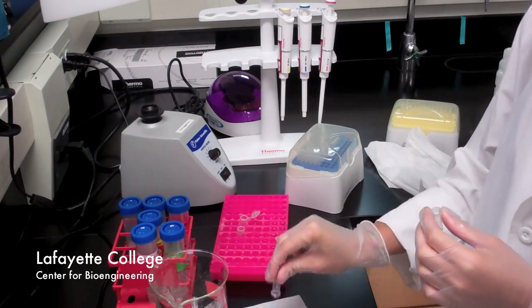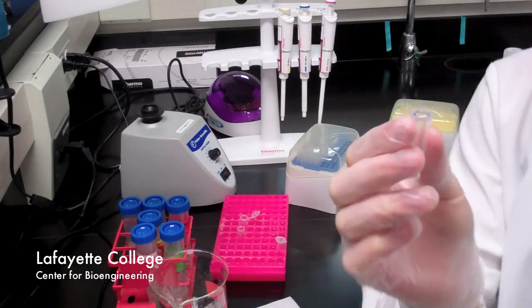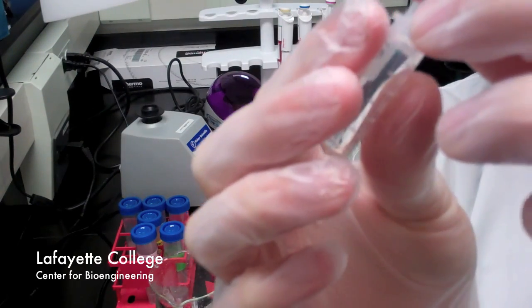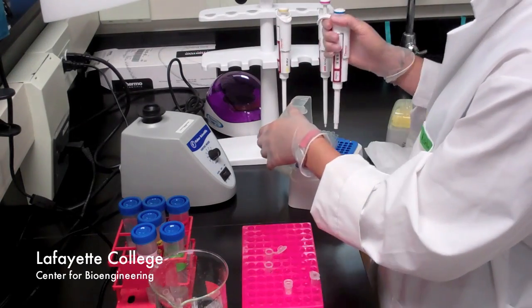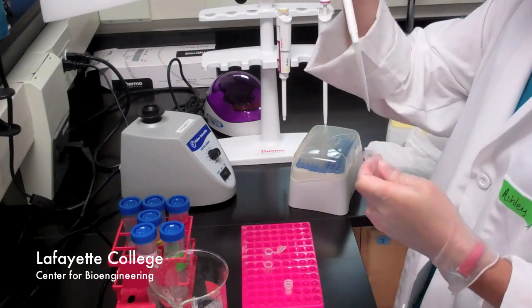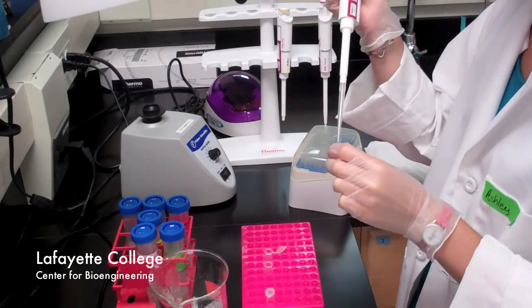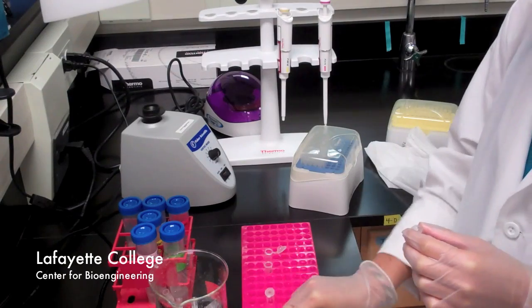Tap the column on a Kim wipe to remove the excess droplets from the tube, and then replace the column in the collection tube. Transfer the remaining solution into the spin column and repeat the centrifuge for 30 seconds at 10,000 RPM. Discard the flow-through as previously described.